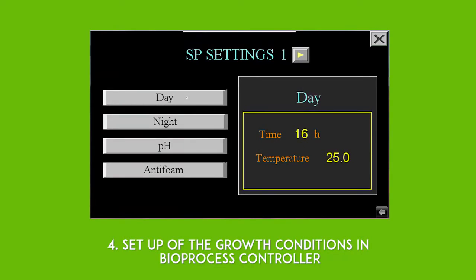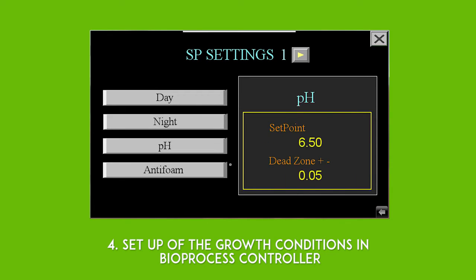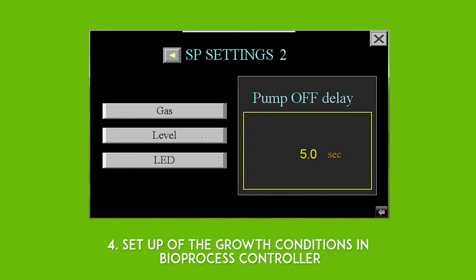Setup of the growth conditions in the bioprocess controller to ensure specific growth conditions for each microalgae. Adjust and control parameters of the process.